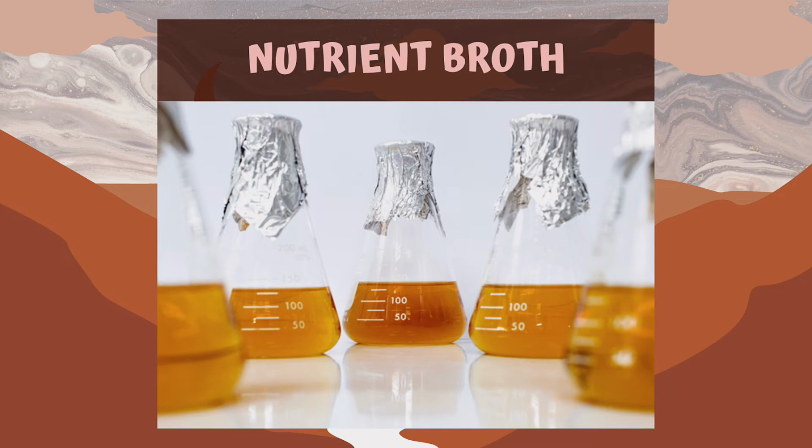Nutrient broth is a liquid culture made out of meat or vegetables, but most likely meat. It is a liquid culture media, and just like nutrient agar, we can also mix blood, body fluids, serums, etc. And with that, it could accommodate fastidious or high maintenance bacteria.